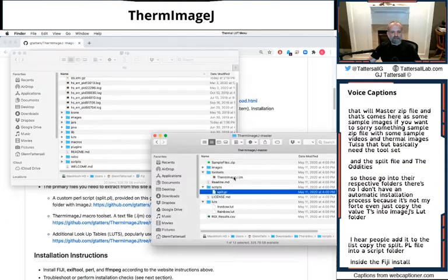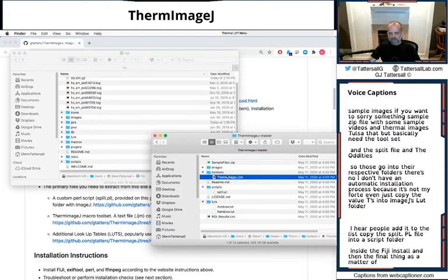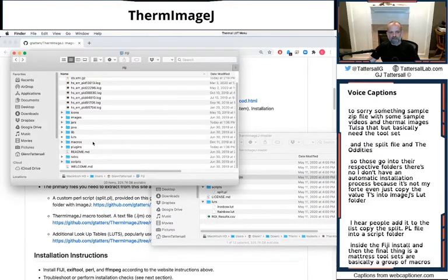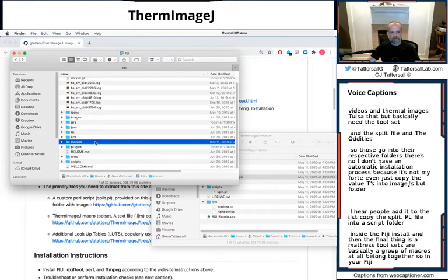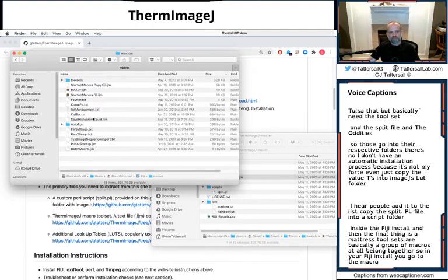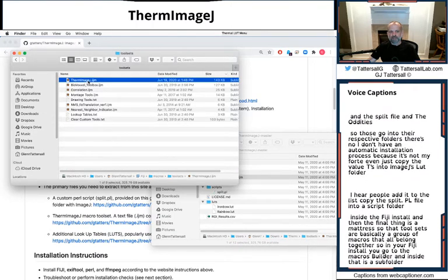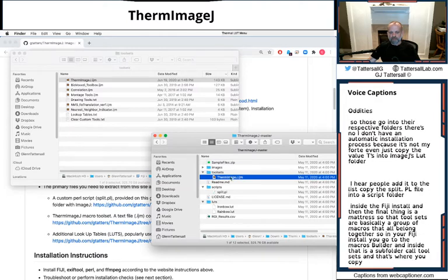Copy the split.pl file into a scripts folder inside the Fiji install. And then the final thing is the macros. So the tool sets are basically a group of macros that all belong together. So in your Fiji install, you go to the macros folder and inside that is a subfolder called tool sets. And that's where you copy the thermimagej.ijm file.